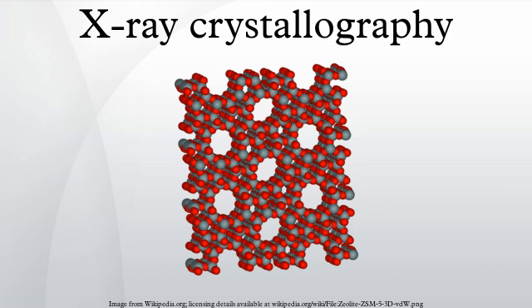The crystallographer's goal is to identify solution conditions that favor the development of a single, large crystal, since larger crystals offer improved resolution of the molecule. Consequently, the solution conditions should disfavor the first step but favor the second, so that only one large crystal forms per droplet. If nucleation is favored too much, a shower of small crystallites will form in the droplet, rather than one large crystal. If favored too little, no crystal will form whatsoever. It is extremely difficult to predict good conditions for nucleation or growth of well-ordered crystals.